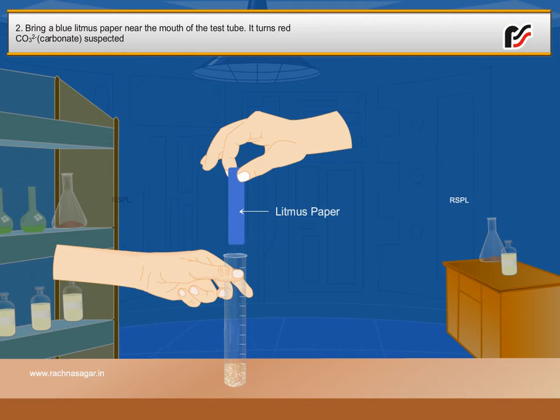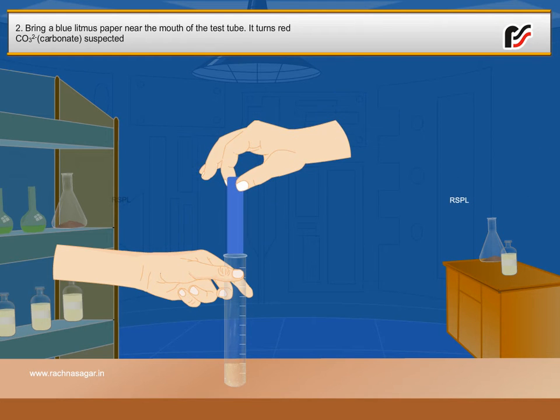Bring a blue litmus paper near the mouth of the test tube. It turns red. CO32 minus carbonate suspected.